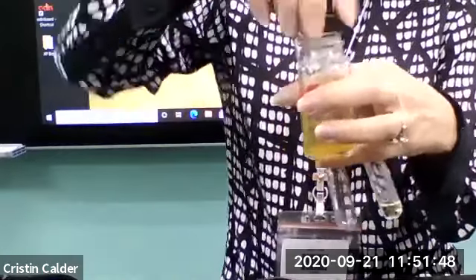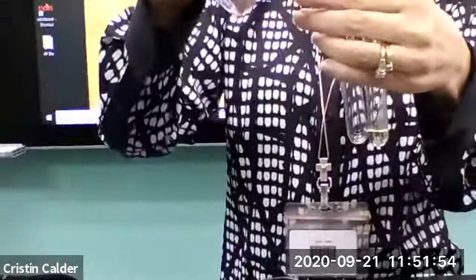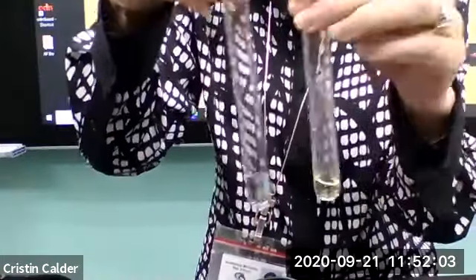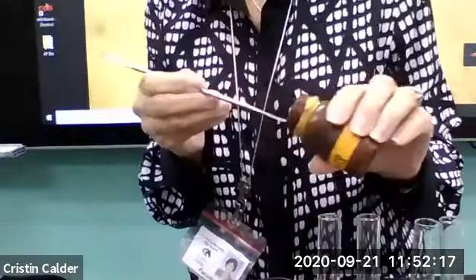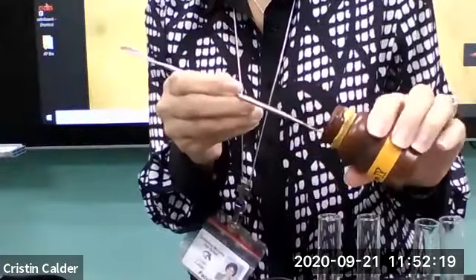All right, so there's my oil. And in my other test tube, again, my negative control here is water. So again, my standard is my positive test so that I can see the difference. Okay, so I've got my water, got my oil, and now I'm going to put a little bit of Sudan IV. So actually I'm going to set these aside for a second because this is a solid. So I'm going to have to dip this out and actually drop some into each of these tubes.